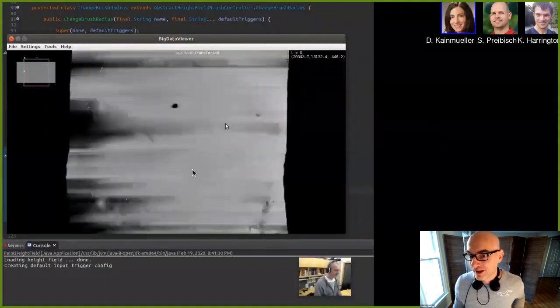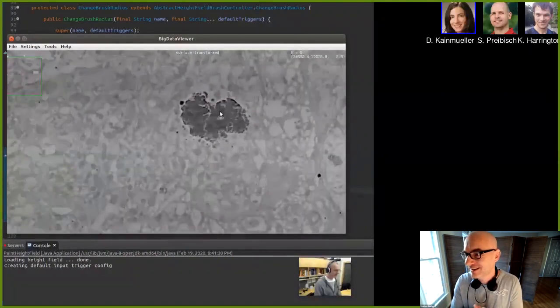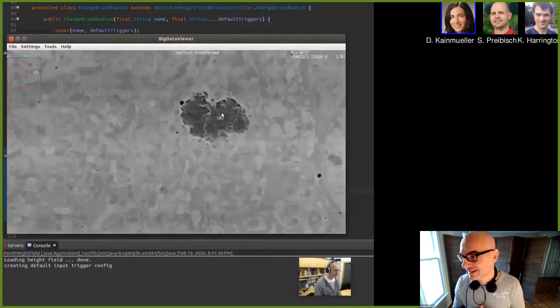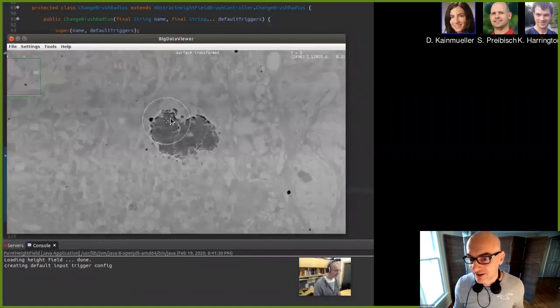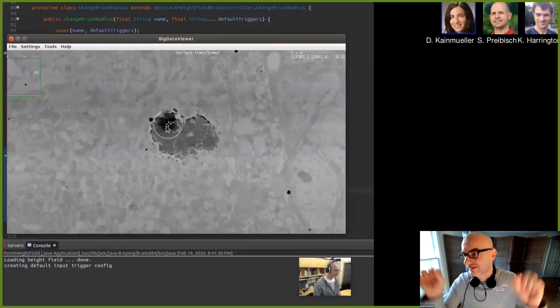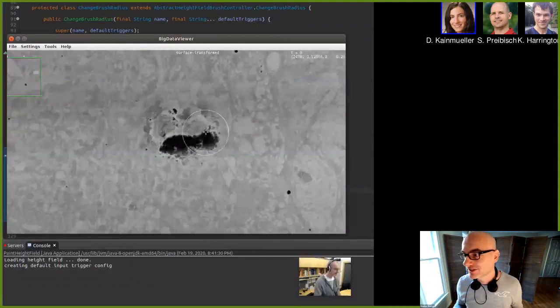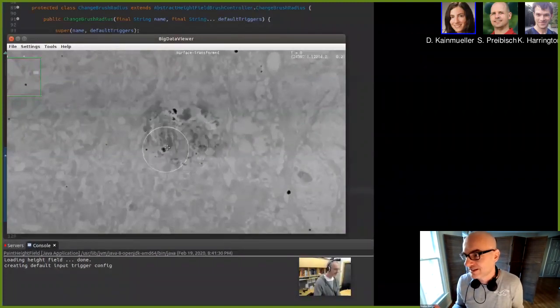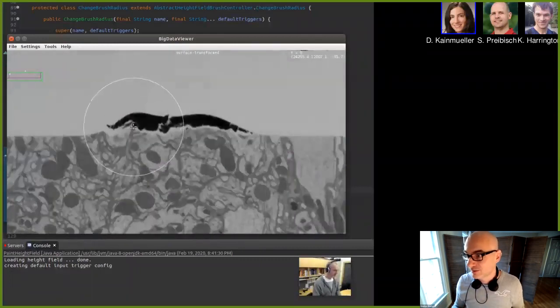So we estimate these surfaces, and while they're mostly good, they have some problems with strange artifacts along these slabs. There are some places where you have dirt particles sitting on the surface, like this black one here. Because it sits so low in the surface and it's still very flat, the surface finder prefers to find the surface on top of the dirt particle instead of under the dirt particle. And it's very difficult to predict what kind of artifacts you will see, because there's always something new going on. So what we need is interactive tools to be able to fix these problems, right?